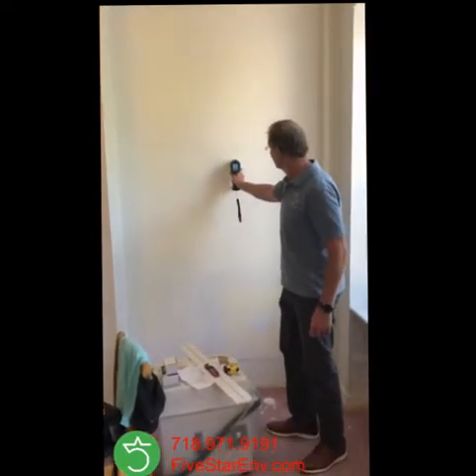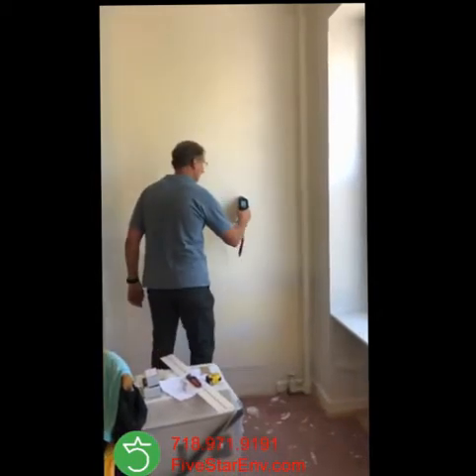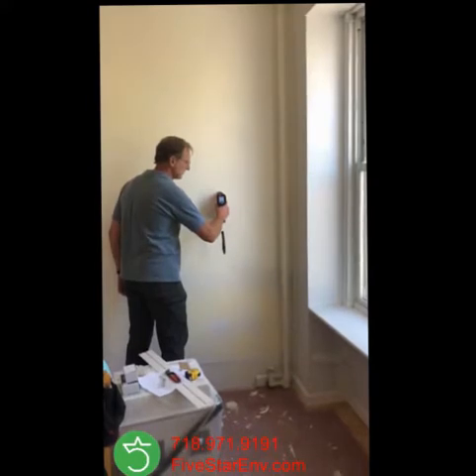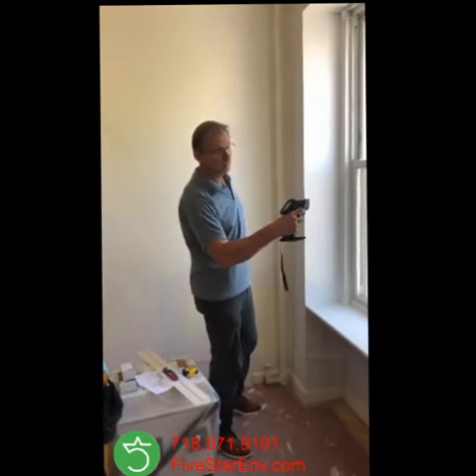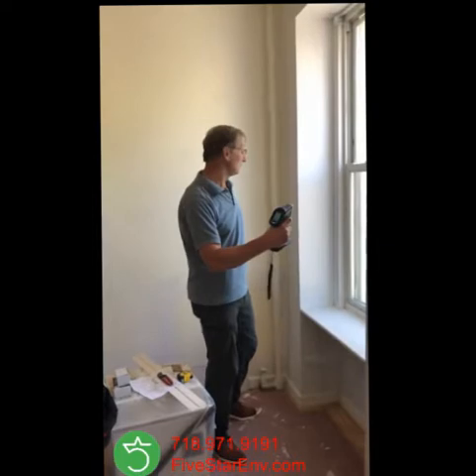Let me just take a reading out of this wall. As you can see, it takes about five to six seconds to take readings with the new instrument, which has a fresh isotope. It's 0.3 milligram per centimeter squared — again, a negative result. Good news for the landlord.